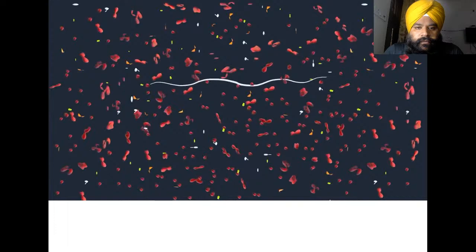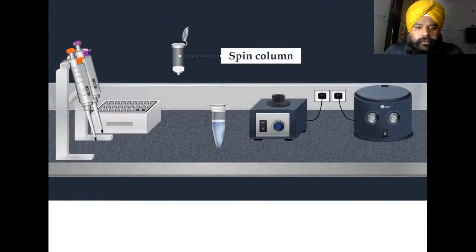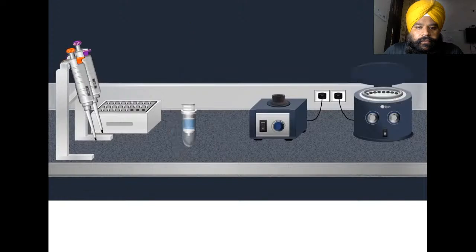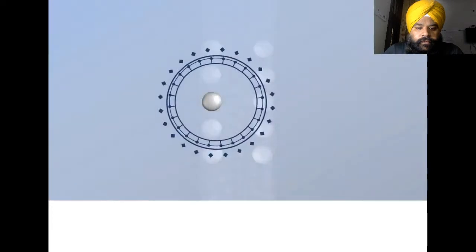Once the sample is lysed, a purification procedure is carried out by using a spin column. The sample is loaded onto the spin column. Then a centrifugation is performed. This procedure is a solid phase extraction method, in which the stationary phase consists of a silica matrix.